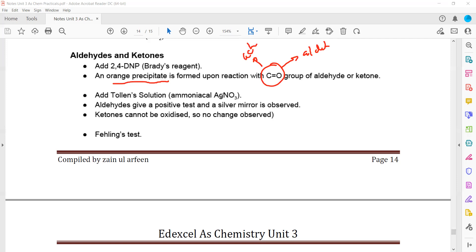To distinguish whether a carbonyl compound is an aldehyde or a ketone, we use Tollens' reagent, also known as the silver mirror test. When Tollens' reagent is added to a test tube containing an aldehyde, a positive result is observed — silver metal deposits on the wall of the test tube, forming a silver mirror. Ketones cannot be oxidized, so no change occurs.